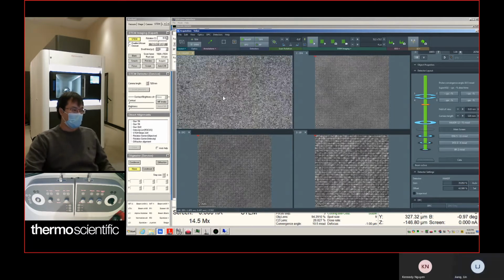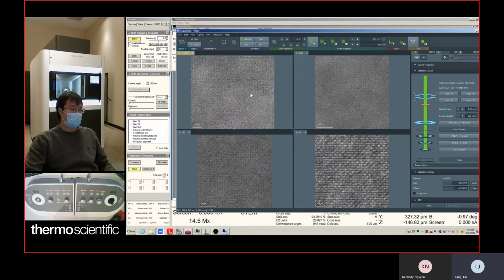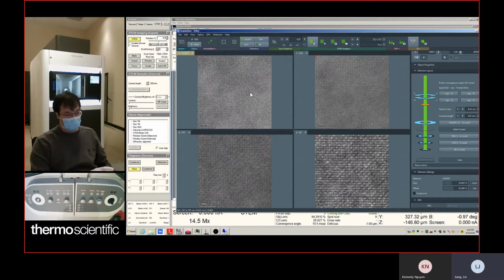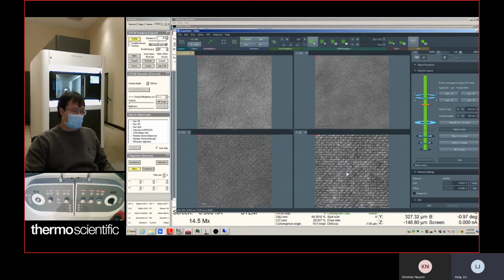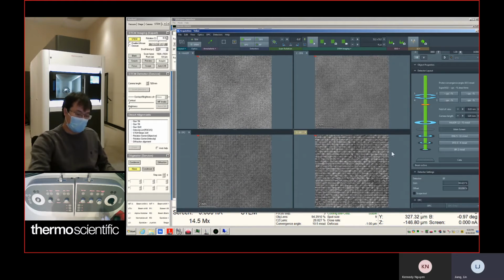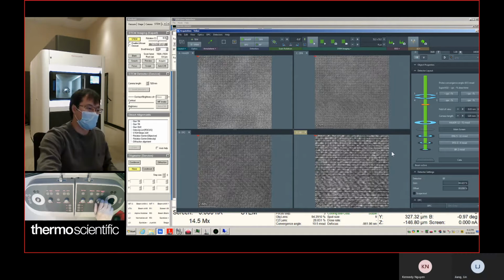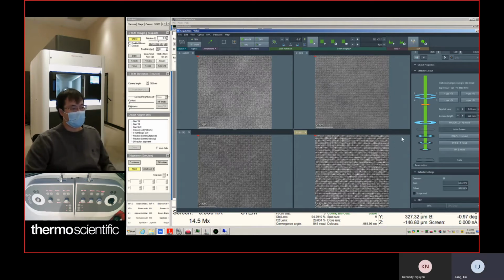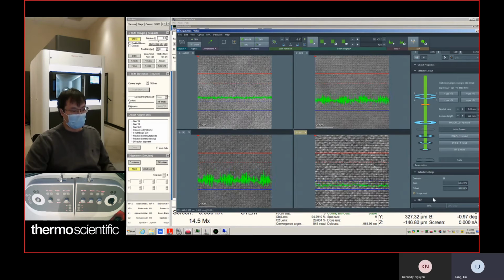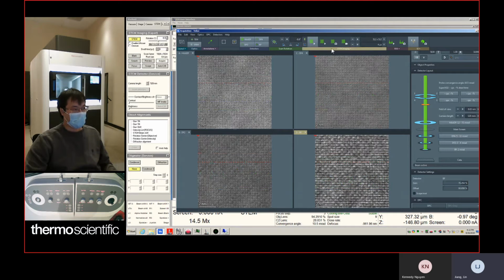So basically you'll have a hard time getting atomic resolution imaging using a HAADF detector. But the good thing is you might still see it through the bright field detector, which is good, and you can just take an image.